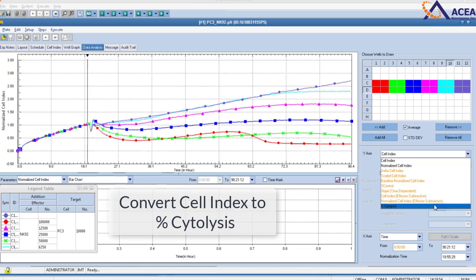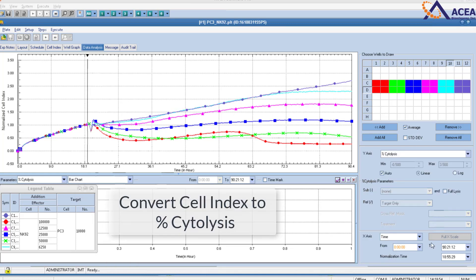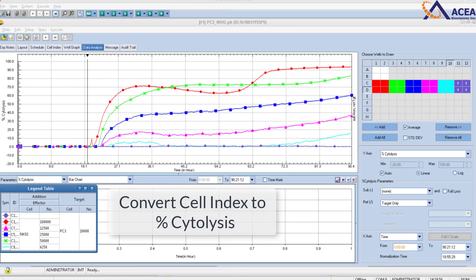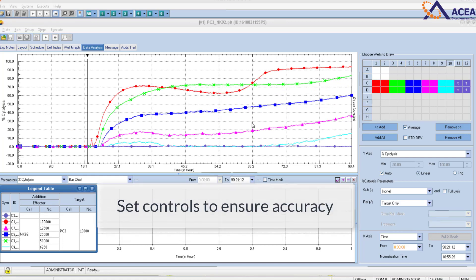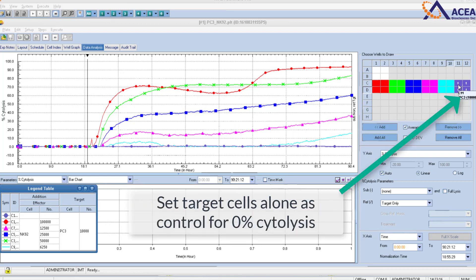Easily convert cell index to percent cytolysis. You can also set various controls to ensure accuracy. Target cells alone are set as a control for 0% cytolysis.